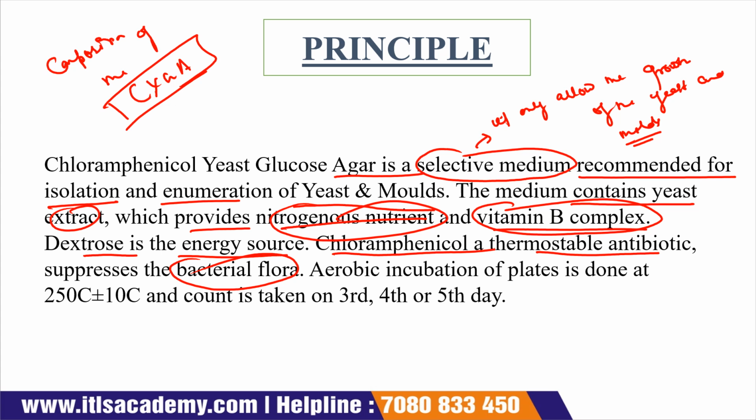So chloramphenicol is a thermostable antibiotic, and when we use it, it will suppress the other bacterial flora and only allow the growth of yeast and mold.